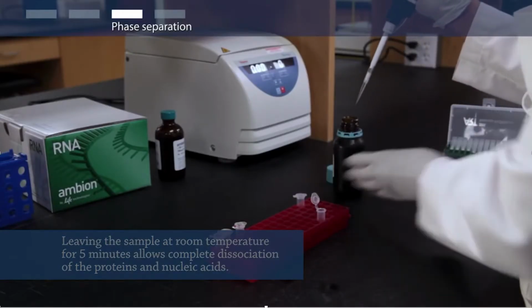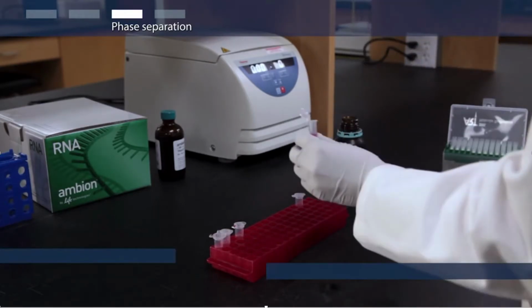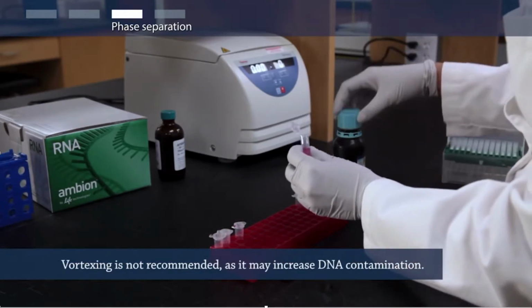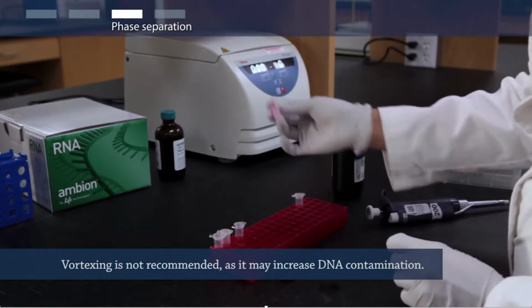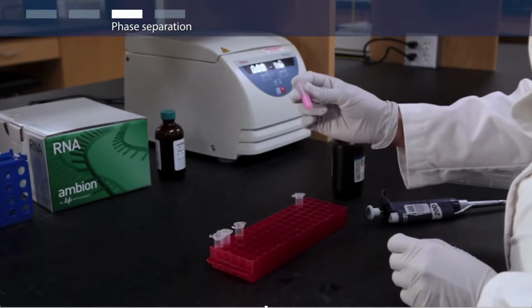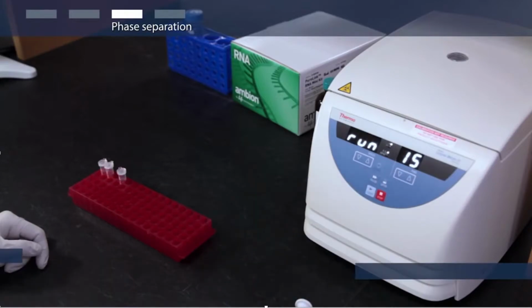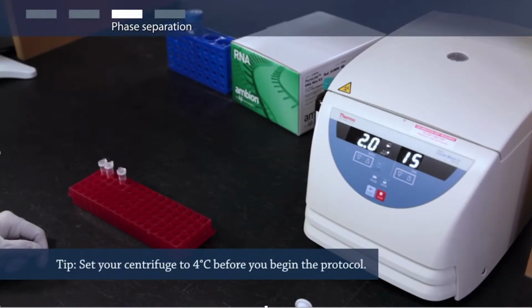Next, add 0.2 ml of chloroform and shake the tube vigorously for about 15 seconds. Then let the tube sit for 2 to 3 minutes at room temperature. Centrifuge your sample at 12,000 g for 15 minutes at 4 degrees Celsius.